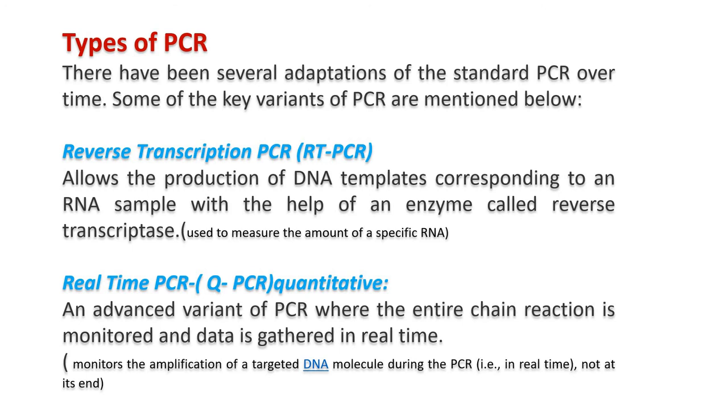طبعا PCR لما discovered صار بي several adaptations and variations حسب الحاجة وحسب تطور الاحتياج إليه، وبالتالي عندنا some variants of PCR راح نذكرها على عجالة. The reverse transcriptase PCR technique يسموه RT-PCR. هذا طبعا we are using reverse transcriptase enzyme, which allows the production of a DNA template corresponding to an RNA sample.